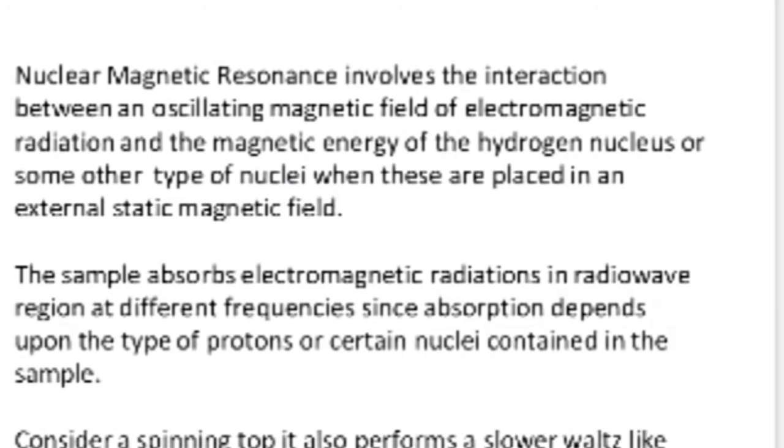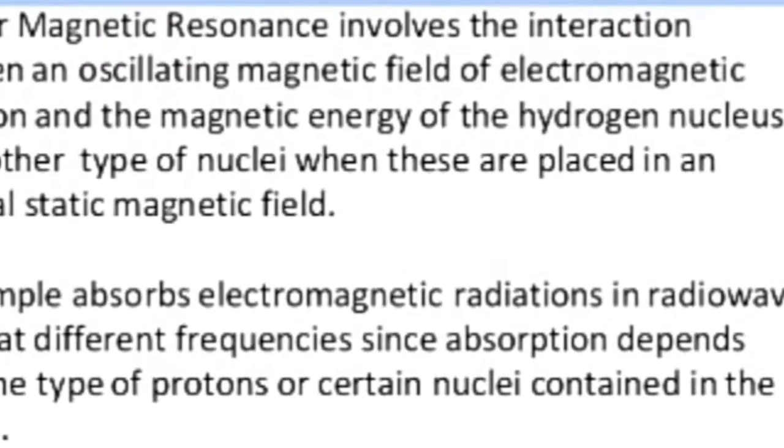Nuclear magnetic resonance involves the interaction between an oscillating magnetic field of electromagnetic radiation and the magnetic energy of the hydrogen nucleus or some other type of nuclei.